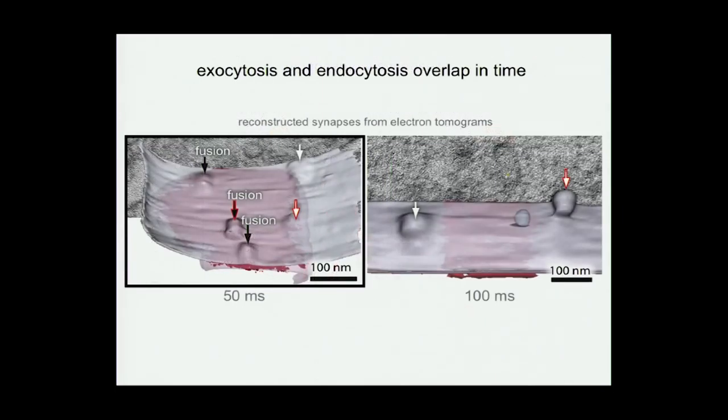So this is a tomogram. And it's really an important image, so I want to spend a minute on it.